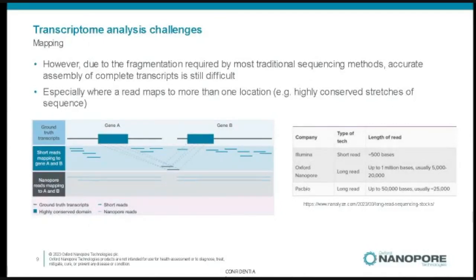So however, this actually poses new challenges. Normally the length of an RNA transcript is approximately 1,500 to more than 5,000 bases. Traditionally, we use a sequencing machine that is capable of only short read sequencing, which can only sequence approximately 500 bases, compared to the aforementioned full-length gene sequence of 1,500 and above. So to solve this problem, fragmentation of individual transcripts into smaller sizes is required.